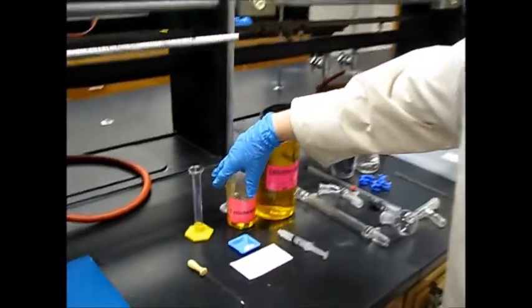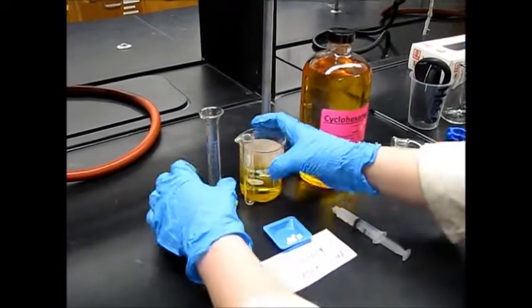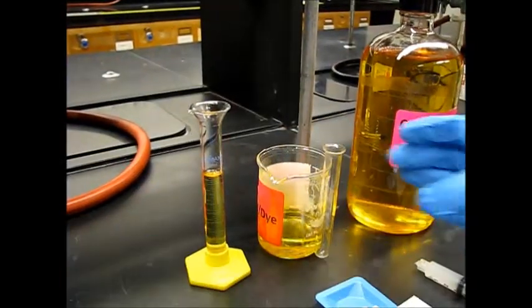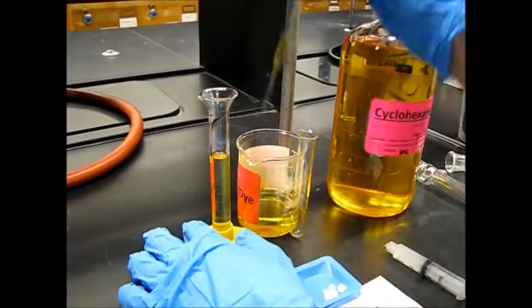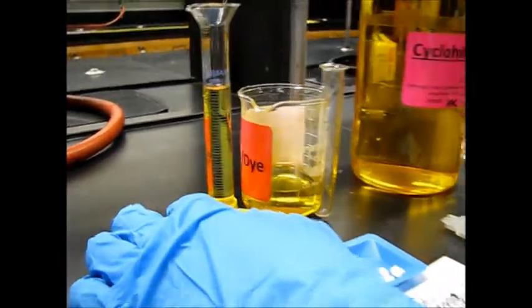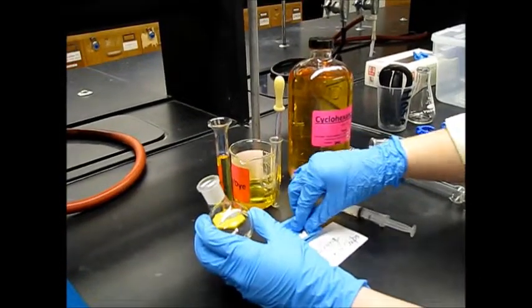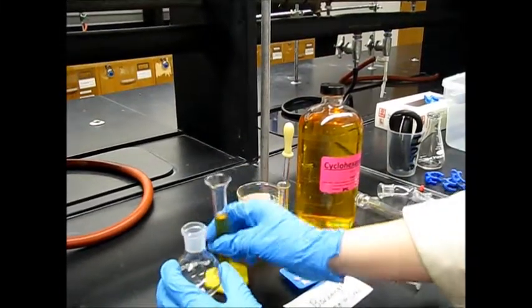We're going to need ten mils of your cyclohexane and dye solution. You're going to pour the first nine mils into your graduated cylinder, and then use a glass pipette with the amber bulb attached to do the last mil to make sure you get accurate sizing. Then we're going to take our round bottom, add two boiling stones, and add all ten mils of your solution.